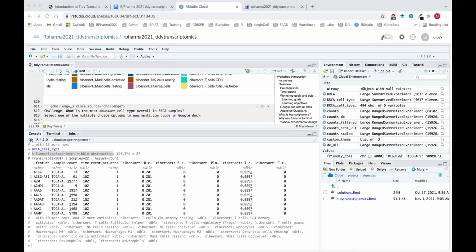Because they're all good methods. I know Limma-voom is good if you've got hundreds of samples. It's a lot faster than EdgeR and DESeq2. So if you're doing any of these big analyses, it's a good one. There is the robust implementation of likelihood ratio of EdgeR that outperforms all the common methods out there if outliers are present. So it's very robust against outliers.